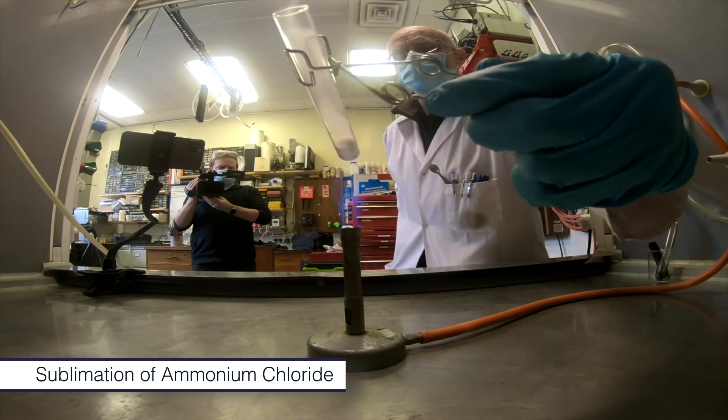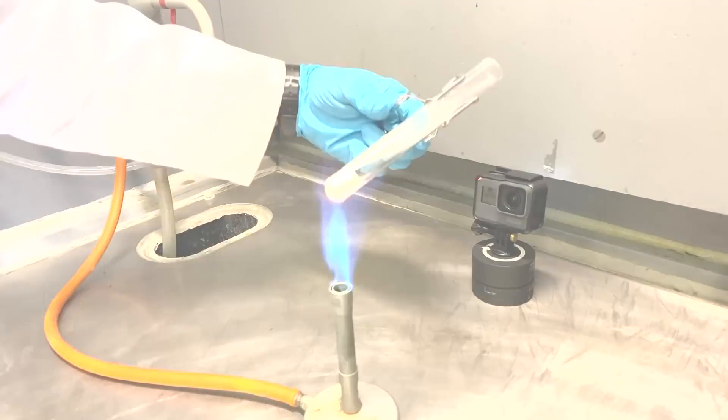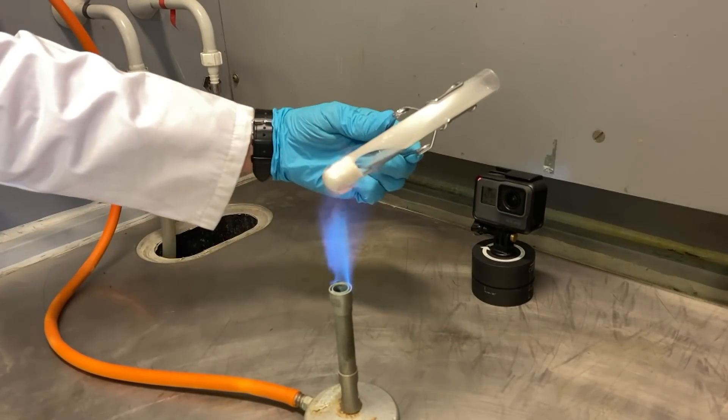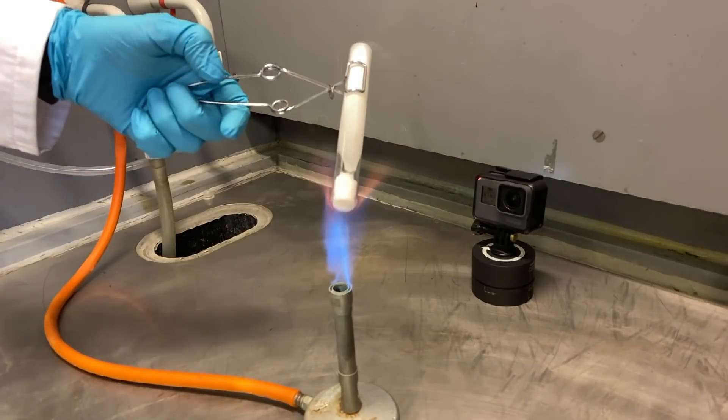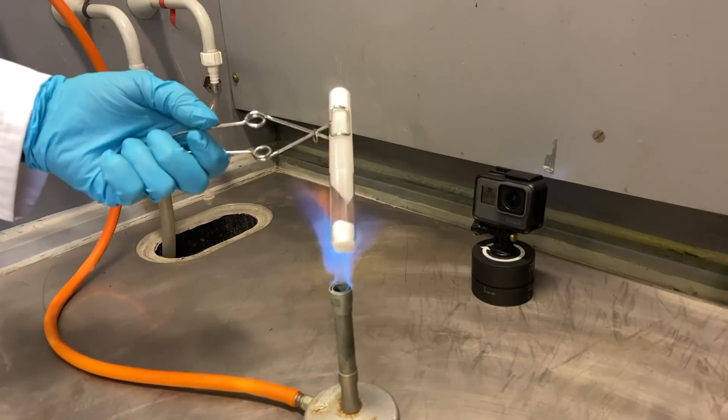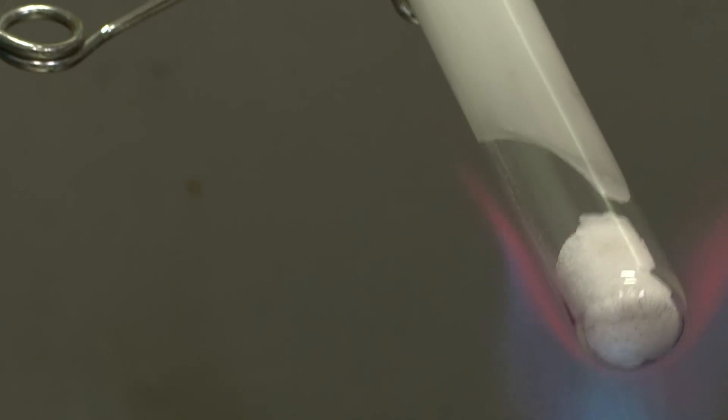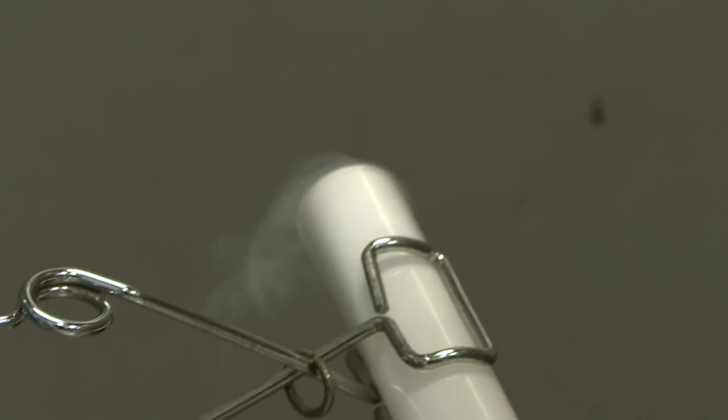So as you heat a test tube with ammonium chloride in it, you can see the white crystals just going up the side of the test tube from the hot part and condensing on the colder part.